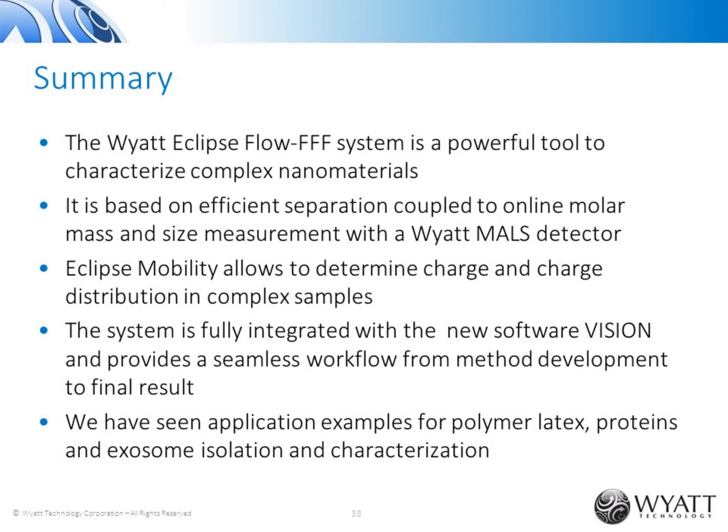Okay. Is there a physical separation of the sample? Can you collect fractions? Yes. This is generally a property of field flow fractionation. You're physically separating your sample into fractions of a certain size, and you can collect fractions and use them for further offline analysis methods like electron microscopy. You can also use a larger footprint channel that we call semi-prep, and you can inject larger amounts on a bigger footprint channel to generate more material in a given size fraction that you can collect.